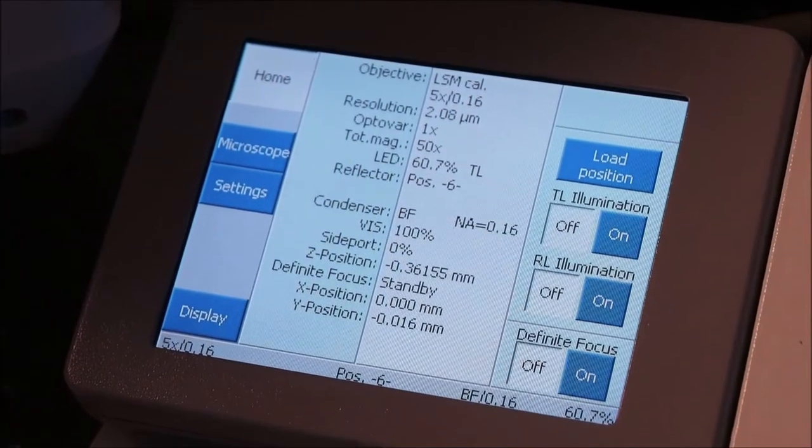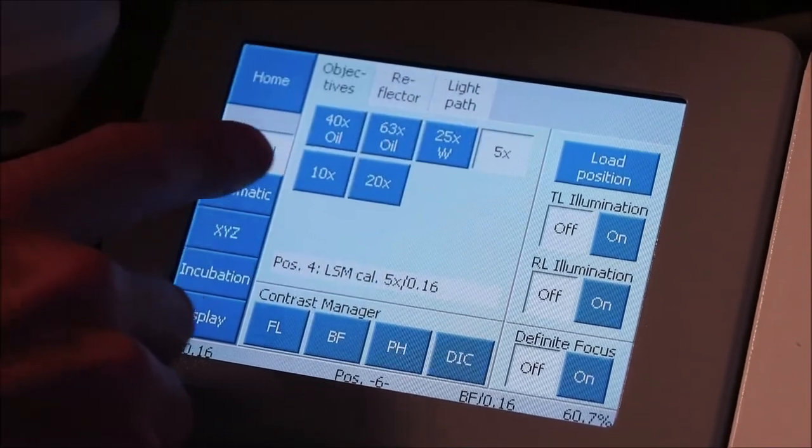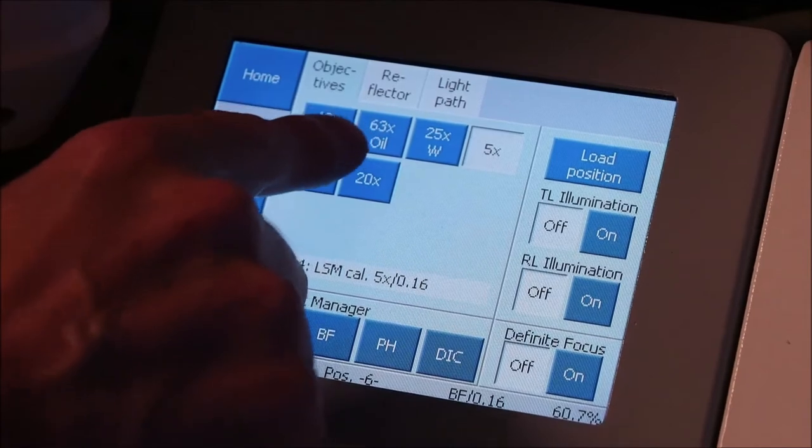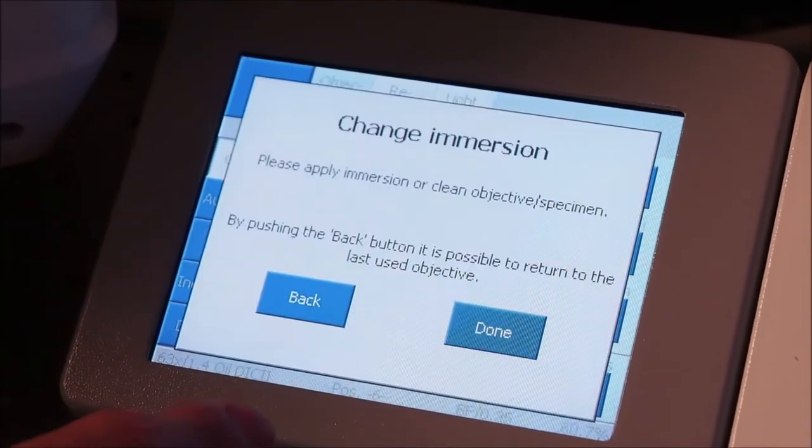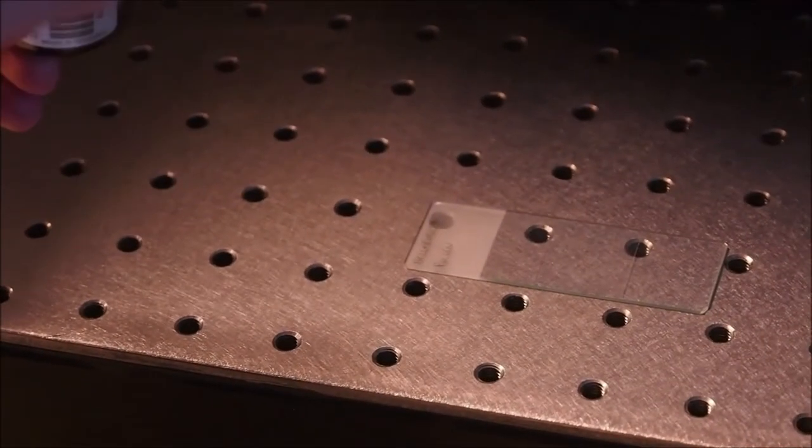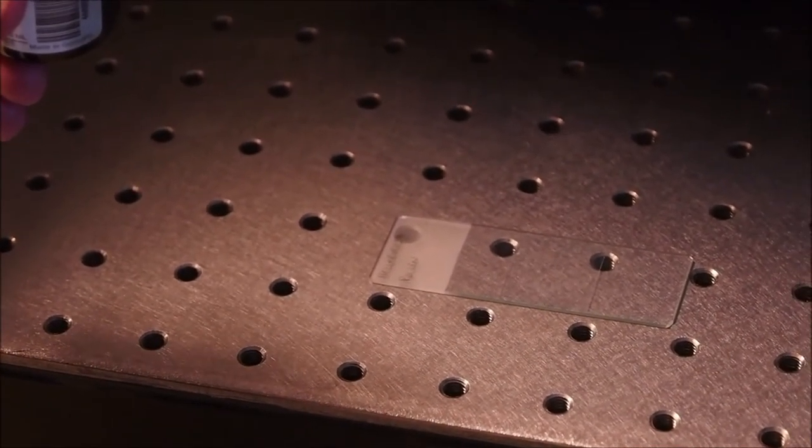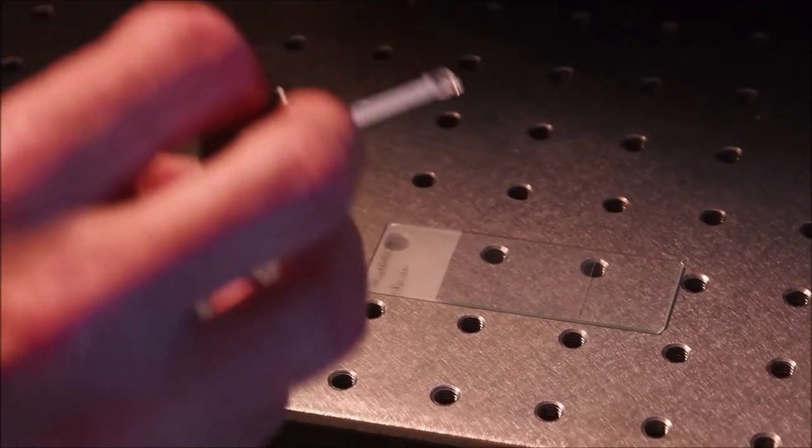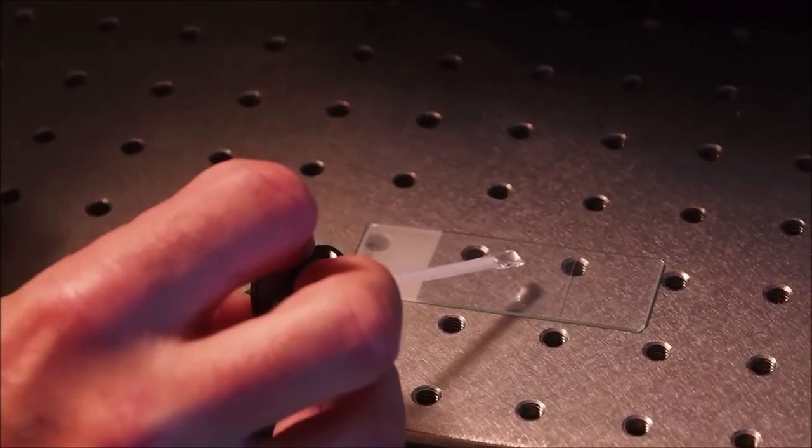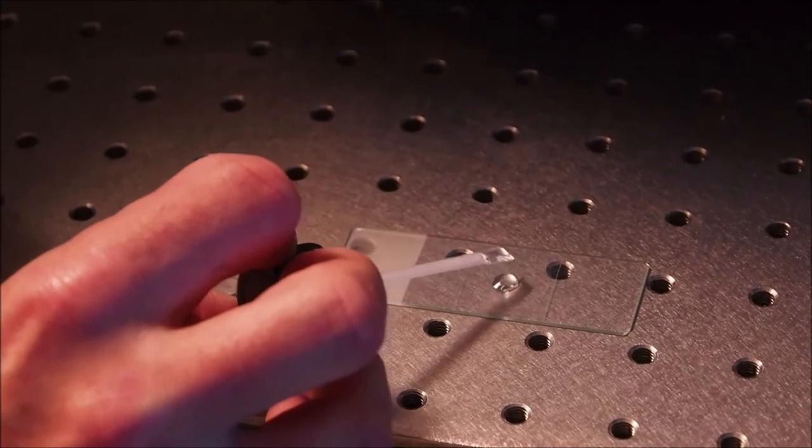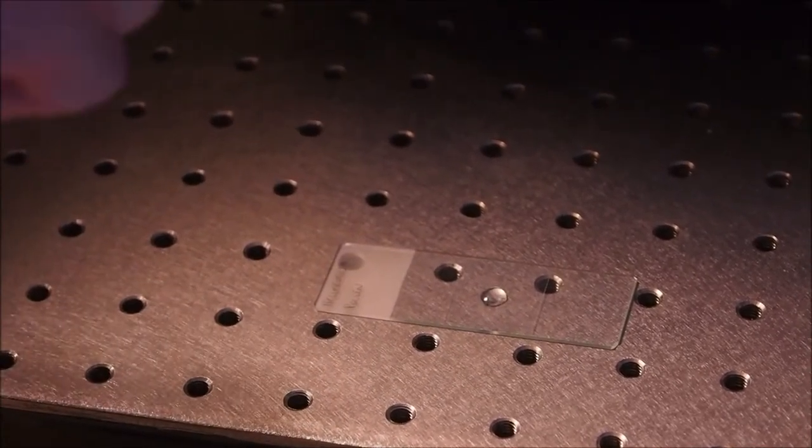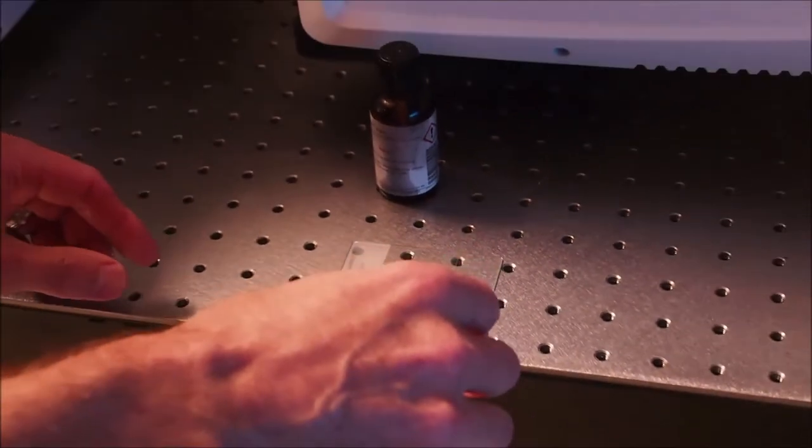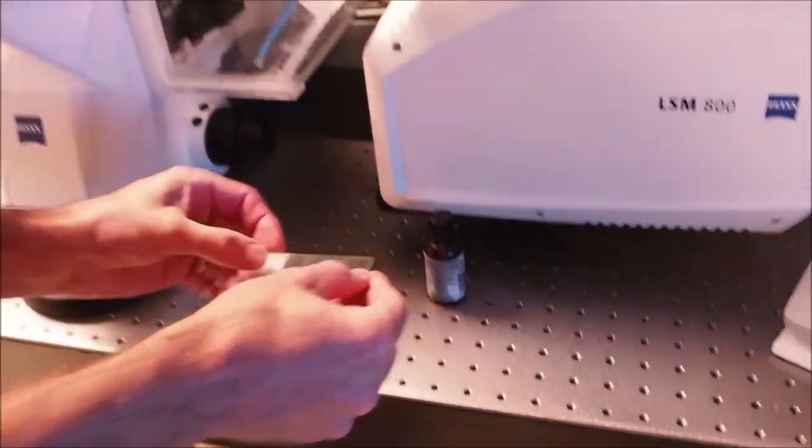To swap to an oil immersion objective, under the microscope tab of the touch screen, choose a suitable objective such as the 63x. The touch screen will freeze and ask you to apply the immersion medium to your coverslip. Using the applicator attached to the lid of the oil bottle, collect a small drop of oil on the end and carefully apply a drop to the coverslip of your sample. This Immersol Oil is classed as a skin irritant, so try to avoid contact with your hands. Remove with alcohol if necessary.